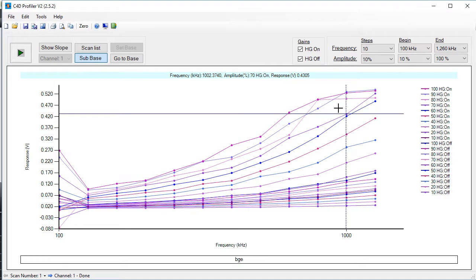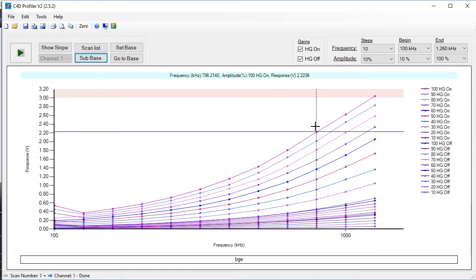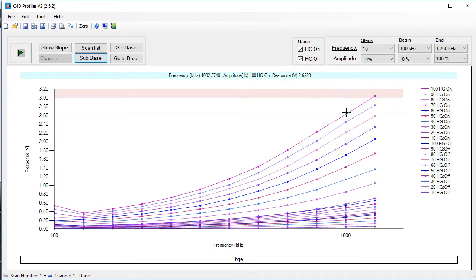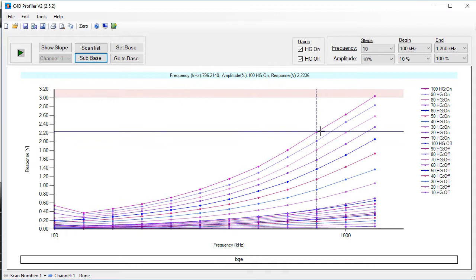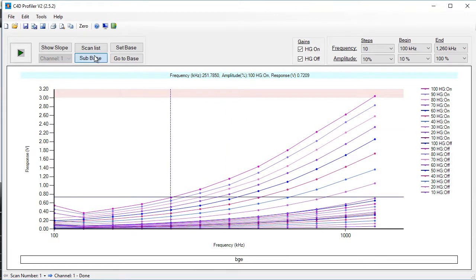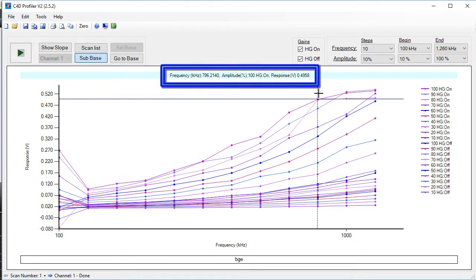But we're not going to pick C4D settings that overloaded the detector. If we remove the base subtraction, we can see that at 100% head stage gain on and 800 kHz, the signal was below 2.5 — so that's good. But at 1000 kHz, the response is above 2.5, so we're going to ignore those points. However, with base subtraction applied, 100% amplitude with head stage gain on at about 800 kHz could be a good C4D setting to use.